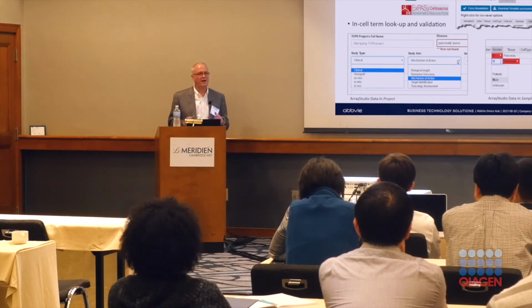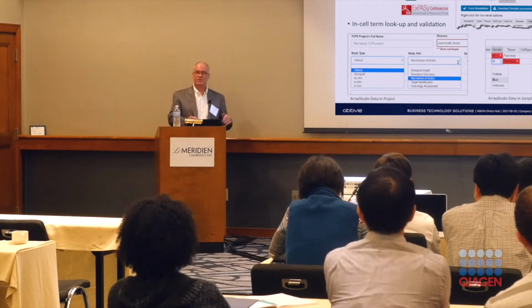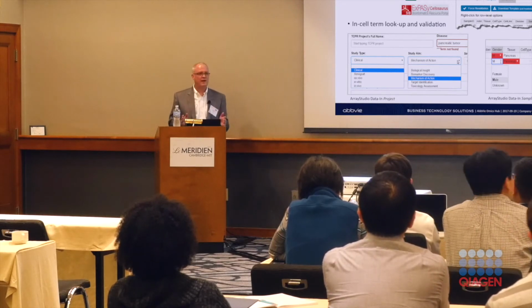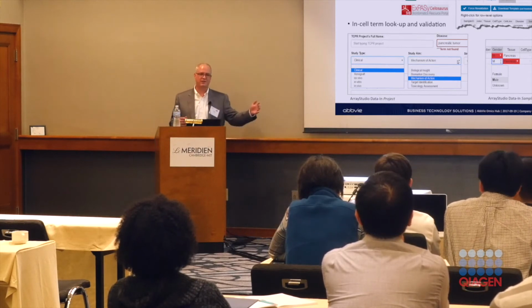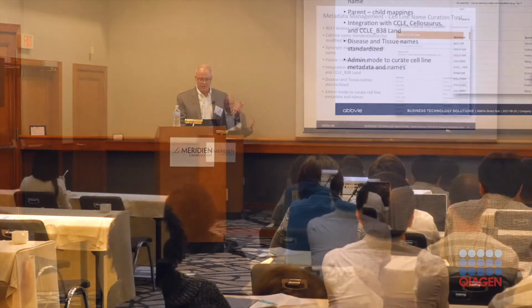So we try to encourage them, hey, you've got a different grouping of your samples. Could you put that in the batch column, right? Or you do this every time. How about a time column, all right? So try to use the columns you already have so we don't have a million columns. But right now, we're still ending up with the text file so that they can still add in a few more things that are very experiment specific.